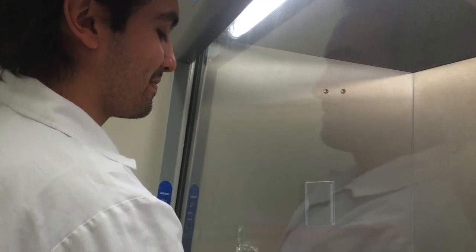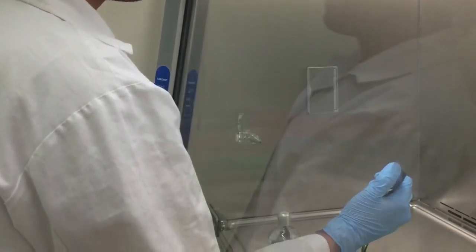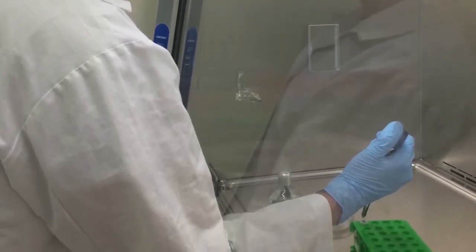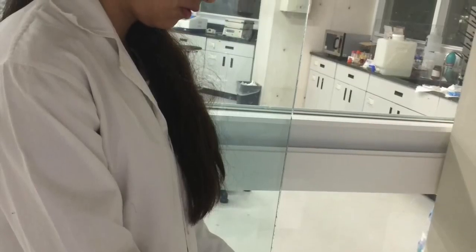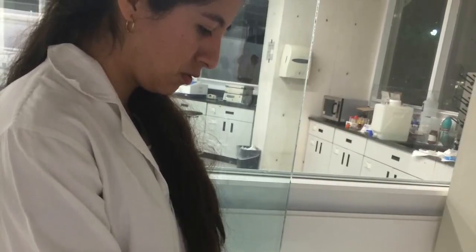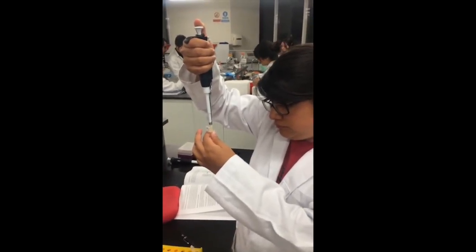As with any protocol, following these steps well and respecting the times is extremely important for obtaining more reliable results. Since very small volumes of reagents are used, you should have proper pipetting techniques to avoid loss and use appropriate aseptic techniques to avoid contamination.